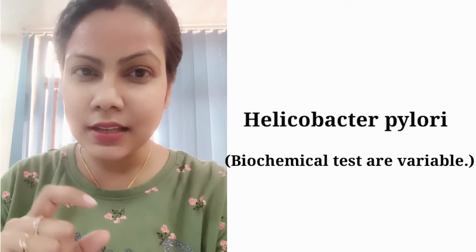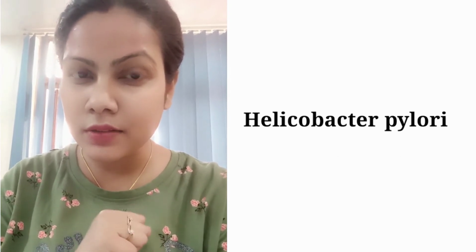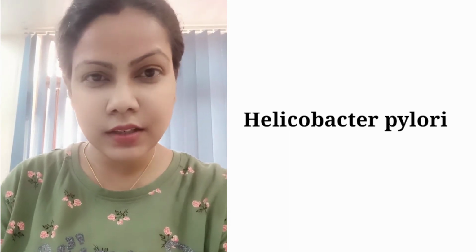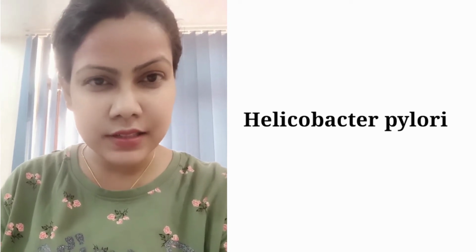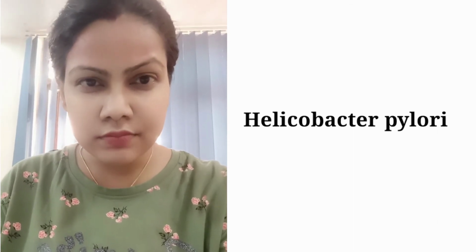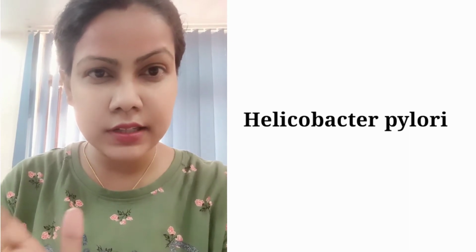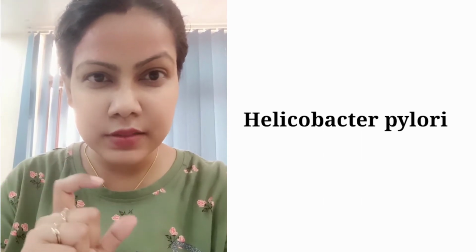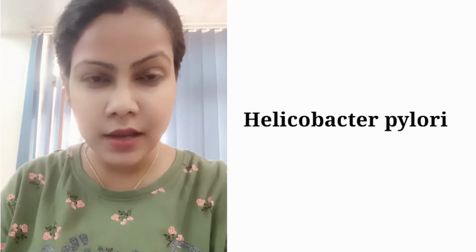So this is the use, why we need Leifson staining. Similarly, there are several flagellated bacteria, and H. pylori infection is a clinical correlation. We can assess the use of Leifson staining in detection of H. pylori infection in a patient having peptic ulcer. So I have given this example. Now let's discuss the steps of Leifson staining.